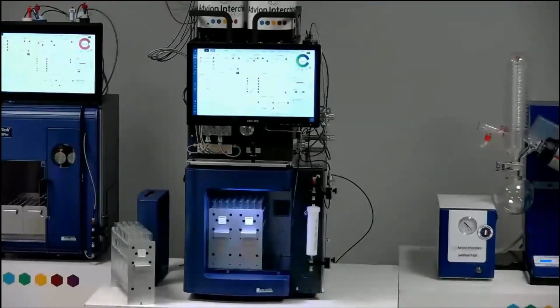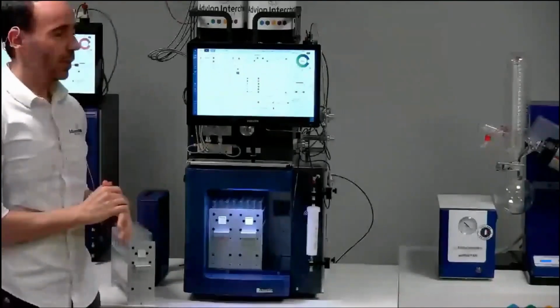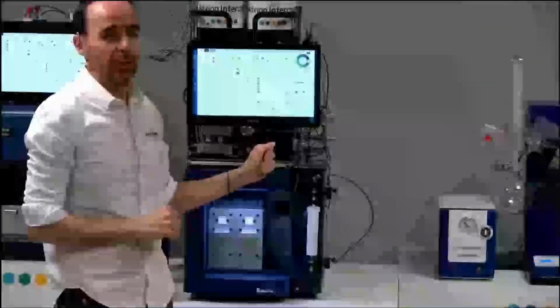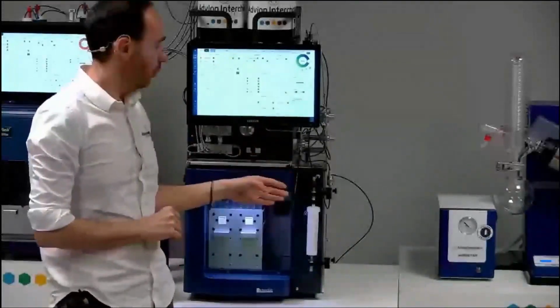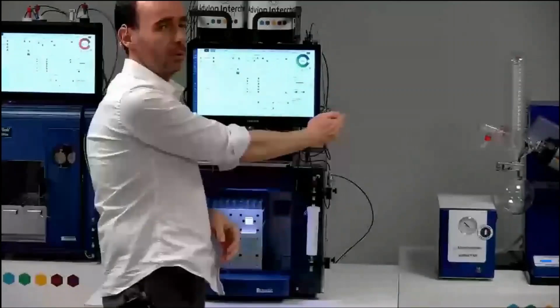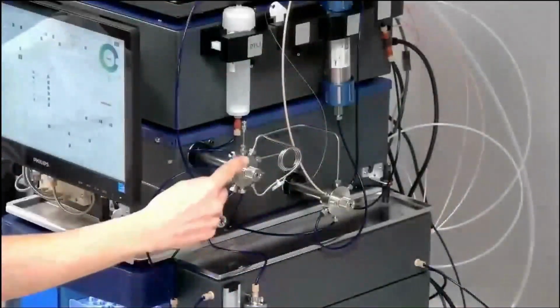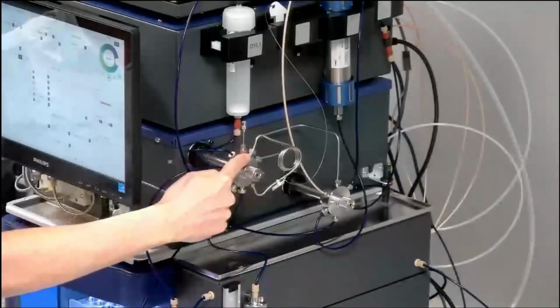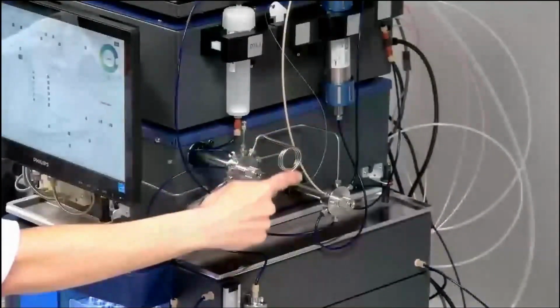Is the sample charged to the column prior to assembly, or is it added in another location? So if you make a manual injection, you can inject the sample directly into your flash column by the top of the column if you want. Or you can use, of course, the valve. Here you have a manual port to inject your sample to fill the loop with your sample.